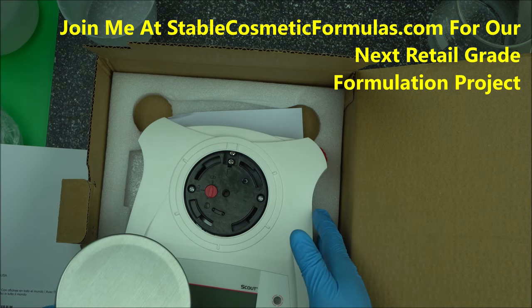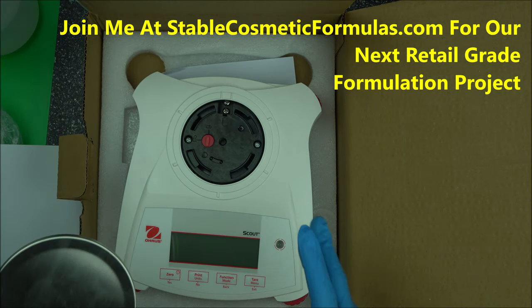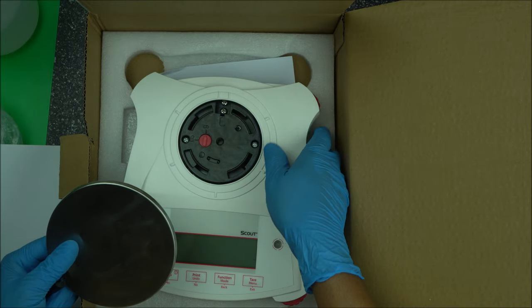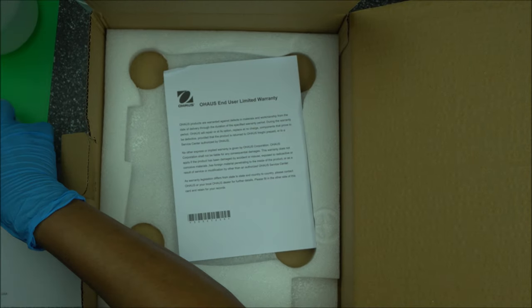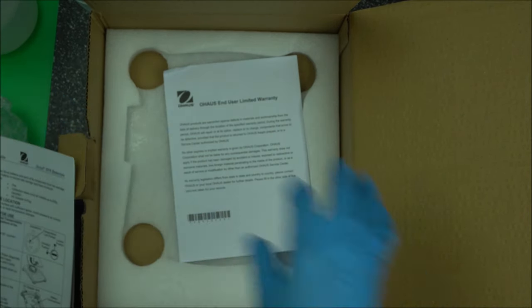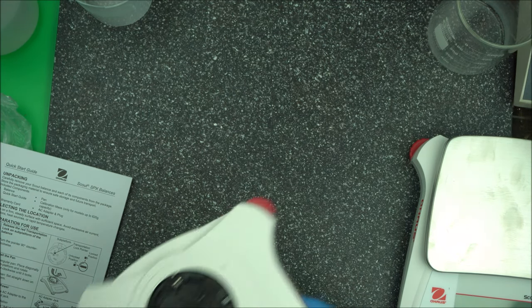If you're buying from an authorized seller, you're going to get it in this type of box. Remove it from the nylon packaging. You're going to see the instruction booklet inside the box — take that out. I'm going to make this video as short as possible.